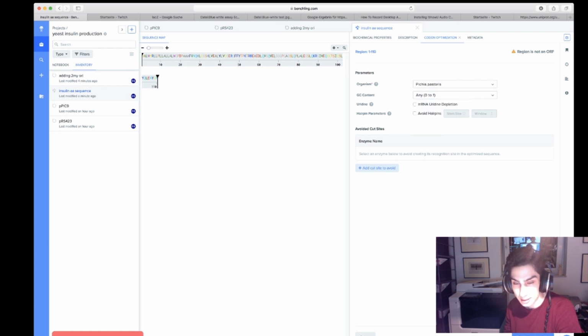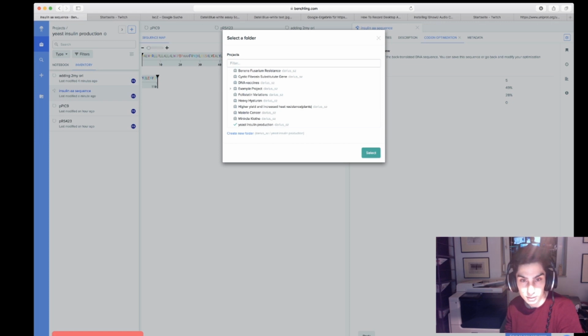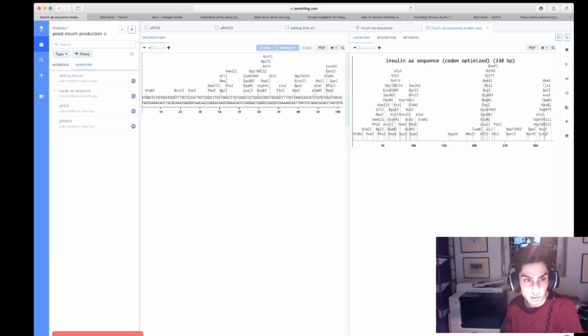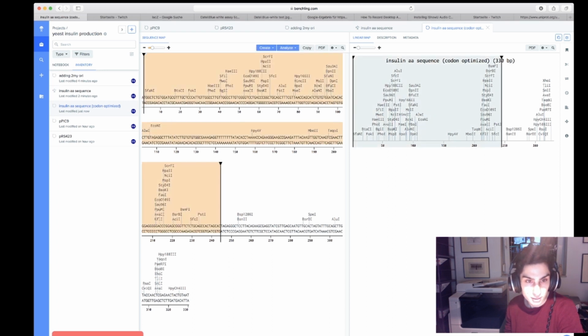All those other things are not really important for us right now. Save as new sequence. Right, now we have the sequence.